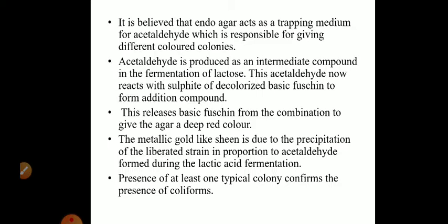Because acetaldehyde combines with the sulfite group present in the decolorized basic fuchsine, the basic fuchsine is released from the combination. This releases basic fuchsine and it gives the agar a deep red color. So we get deep purple or deep red colonies, rather deep purple colonies.